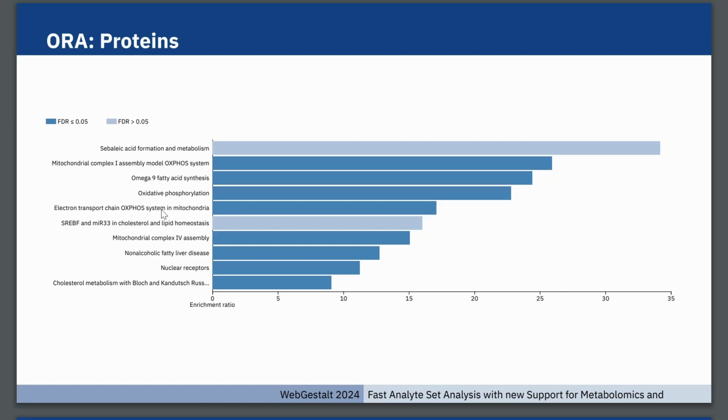What's the current support for PTM analysis, and can that also be integrated into the multi-omics? That's a good question. We do support PTMs. You provide us the sequence and the location of the site, but we only support two or three databases. That is something our lab is very interested in, but currently there's no integration in WebGestalt.